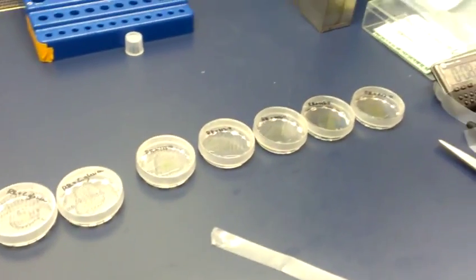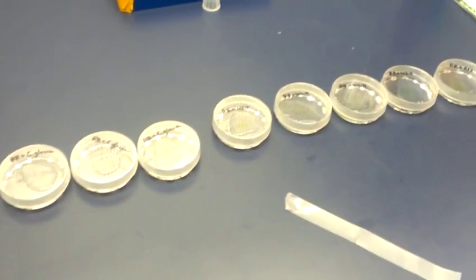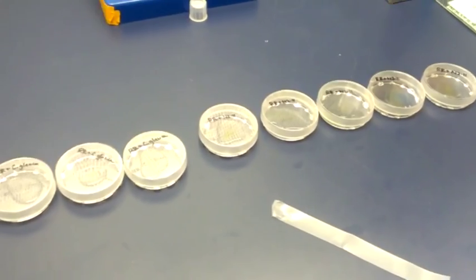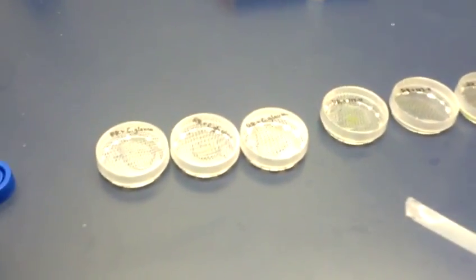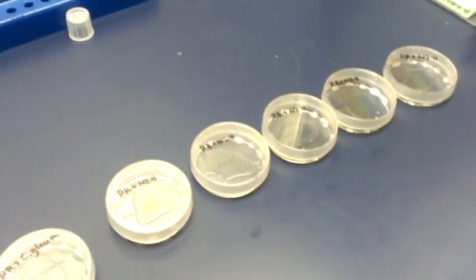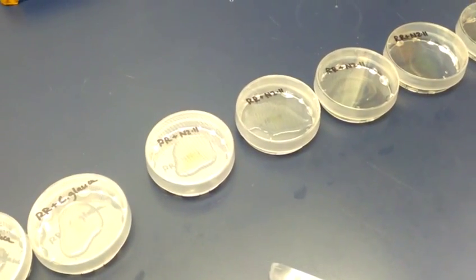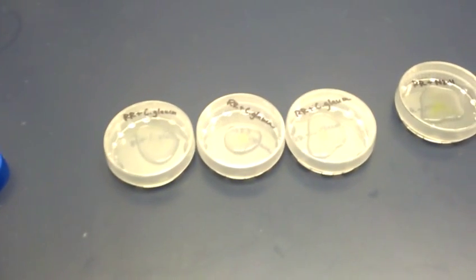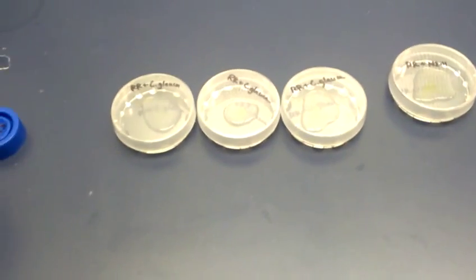Here we are at the Citrus Research and Education Center in Lake Alfred, Florida. We are looking at plates of somatic fusions, and we've got a couple of different varieties. One is ruby red combined with a type of pumelo. The other one is ruby red combined with Citrus Glock and Desert Lime.